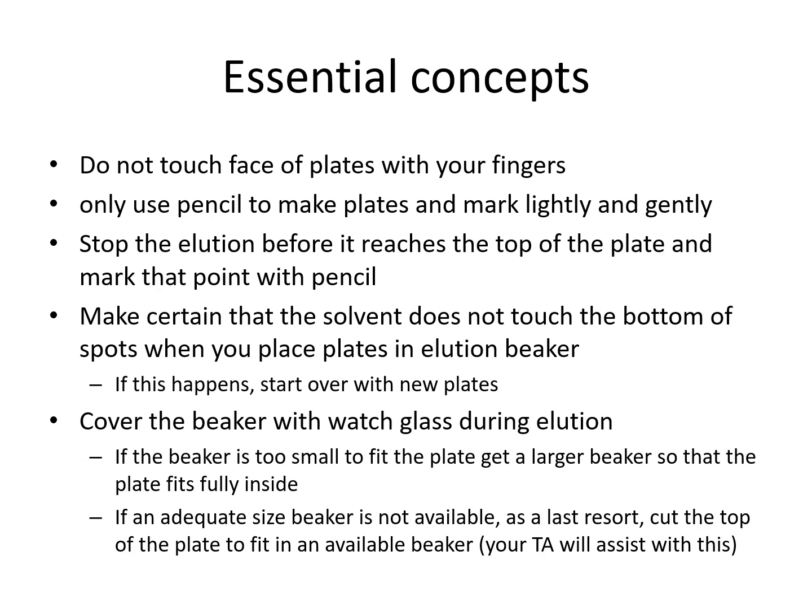Key concepts during the experiment. You do not have to touch the face of the plates, as you can easily contaminate the plates. And when you make the marks for the different samples, and when you draw the line, you have to use pencil. And once the experiment is started, you have to look closely at how the solvent is going.